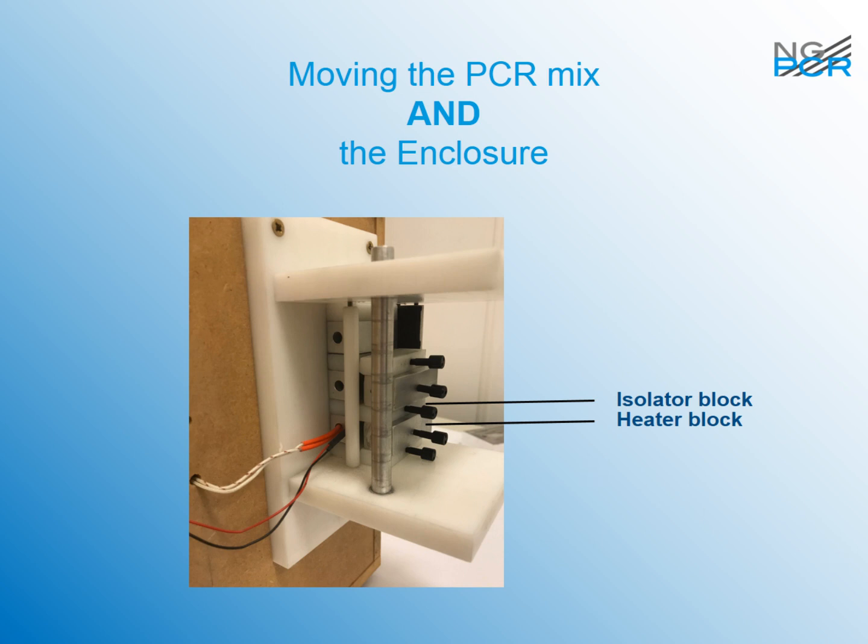And the first experiment was together with Ronnie Kammerts, with whom I'm still working, and he was pulling the blister up and down and pushing the blocks, and I had a stopwatch and said next, next, next, and we did 30 cycles in 10 minutes, and immediately we had a result. And not just some result, but actually a quite perfect, clean result with a good yield. So then we thought, okay, we have something here. We need to make a product out of that.